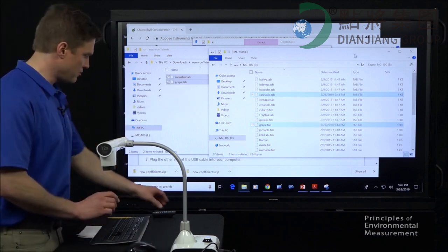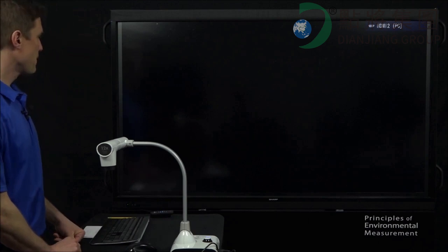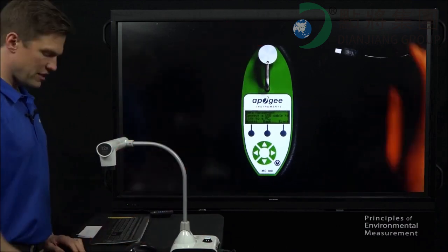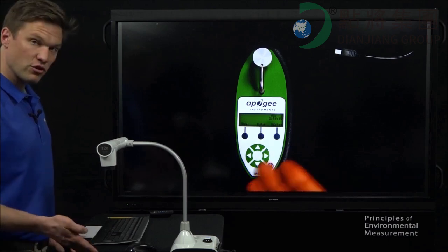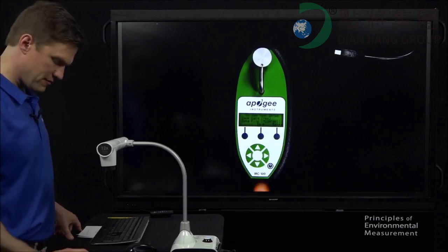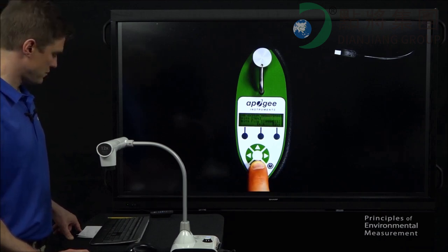And so now I'm going to switch back over to our MC100 display. Okay, we'll just hit this eject button. It says unplug the USB cable. Okay, so now we're back to the usual screen. But we expect we should have new coefficients on here we could select if we want to. So to get to them, we hit run. Then we hit setup. Then we hit the down arrow a couple of times until we get to a screen that says use custom measurement.